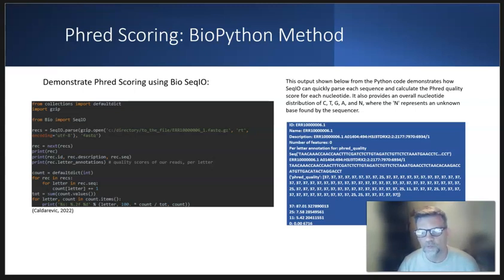After the Python code prints the parsed components, the code proceeds to count the number of records, iterates through each one, reads each letter within the sequence, and creates an array for each unique nucleotide. And then it sums the totals for each one. Finally, the totals are computed into percentage fractions of the total nucleotides.